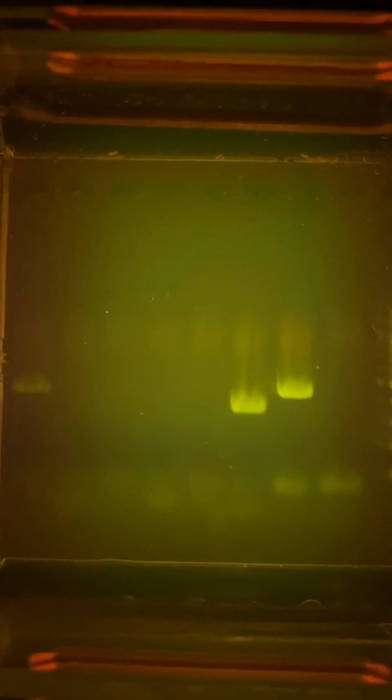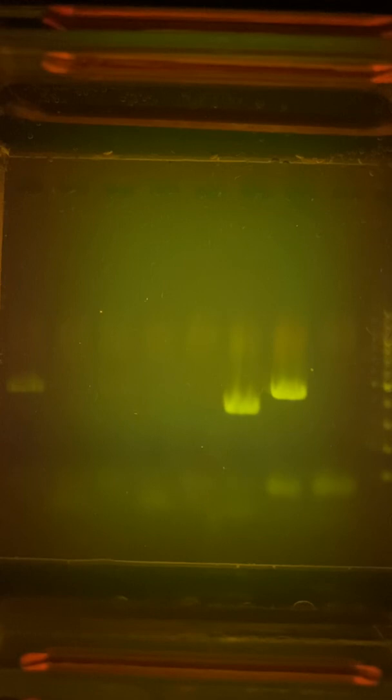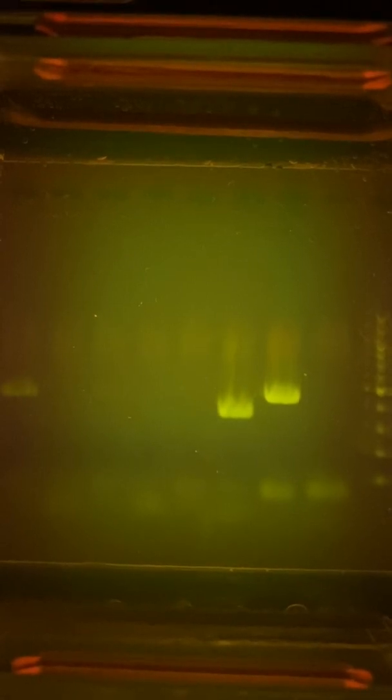But this is really cool. I have eight wells that were filled with my samples that I ran through the PCR — the first two wells is number one, second two wells is number two, third two wells is number three, and fourth two wells is number four. My number three has a Mat 2 mating type, and my number four has a Mat 1 mating type. And if you look over on the far left, there's a very dim band showing that my number one is also a Mat 1 mating type. So my number one and my number four can mate with my number three. I'll have to run the number two again, and I have a bunch more to run to test these ascospores.